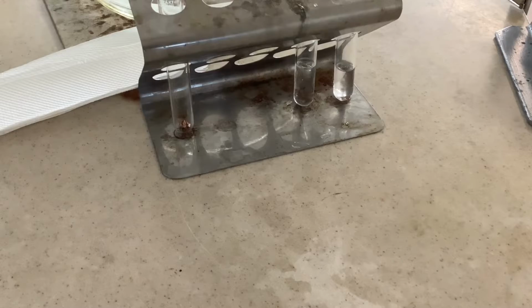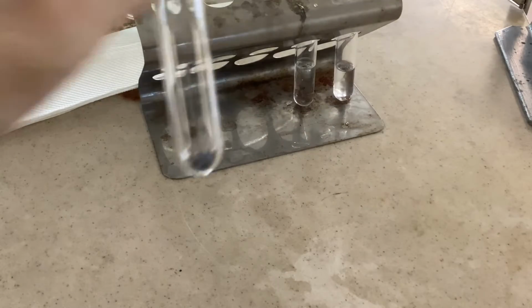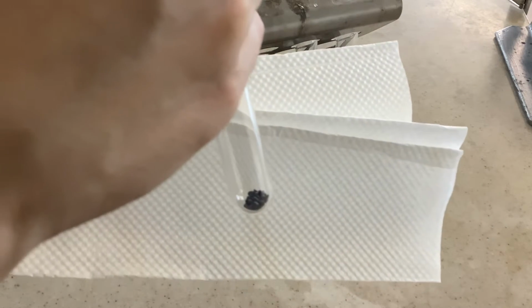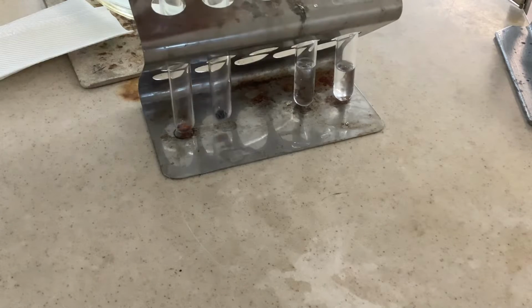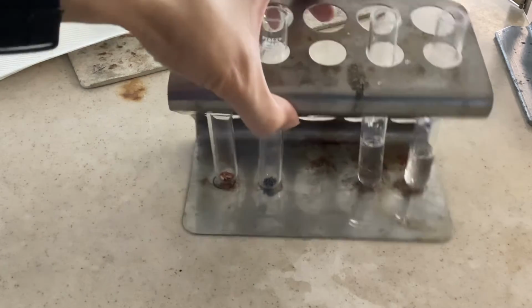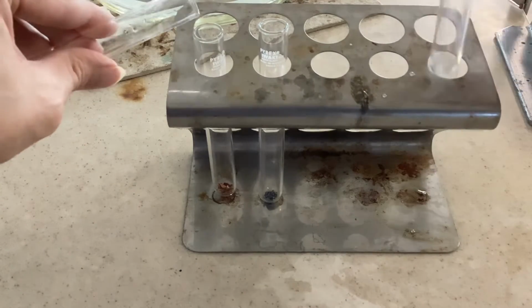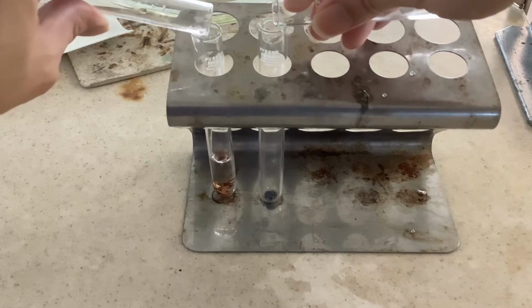And then another one is calcium, Ca with symbol. You see clearly, I use a white background. What can you see? What's the color? Okay, some gray or black solid. And then the next step I would like to do is to pour some water to it, and then we'll see what will happen. For copper and then for calcium, a similar amount of water inside.